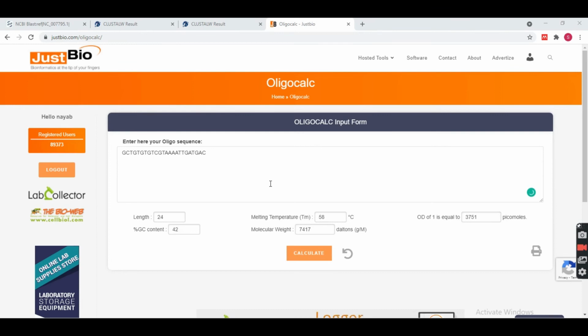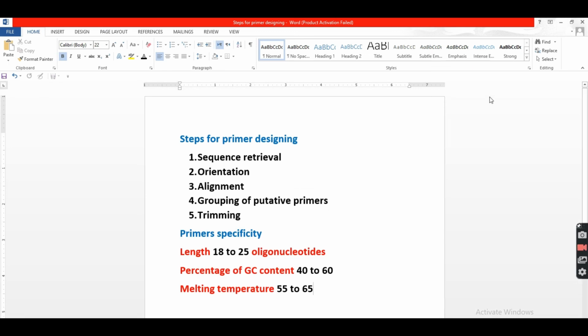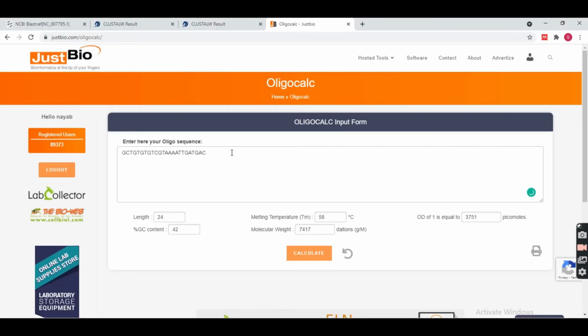Okay, as I have written here, the point of trimming. So what is the role of trimming? Trimming basically helps you in maintaining or optimizing the temperature. How? Suppose I remove this C and then again I calculate, the temperature has decreased. In a similar way, if you have a smaller number of nucleotides like this, if I add all these 4 nucleotides from here and calculate the temperature, it has increased.